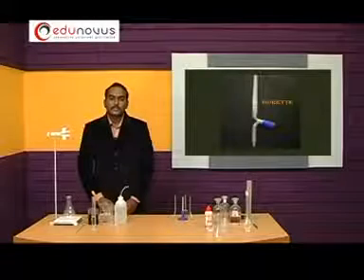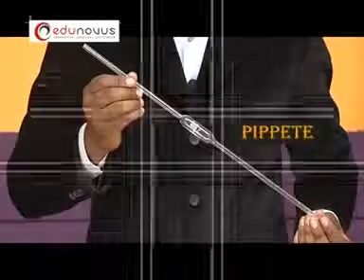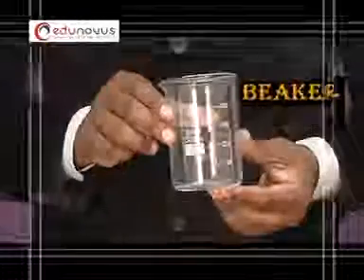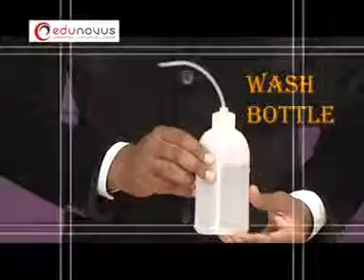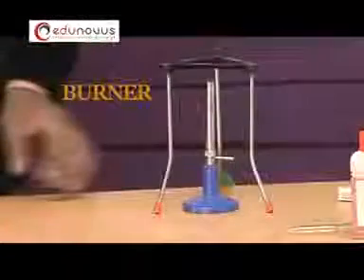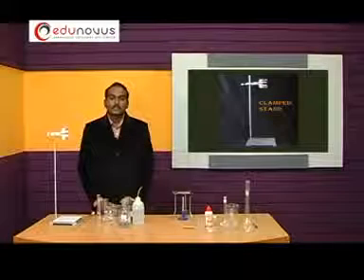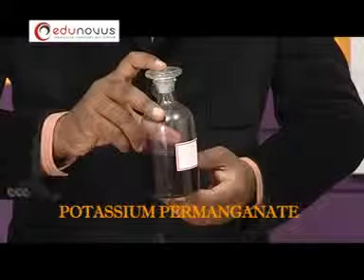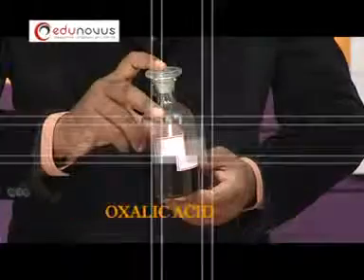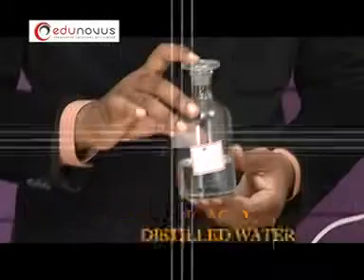Apparatus required for this experiment: burette, pipette, conical flask, beaker, wash bottle, retort stand, glazed tile, and a Bunsen burner. Chemicals required for this experiment: potassium permanganate, oxalic acid, sulfuric acid, and distilled water.